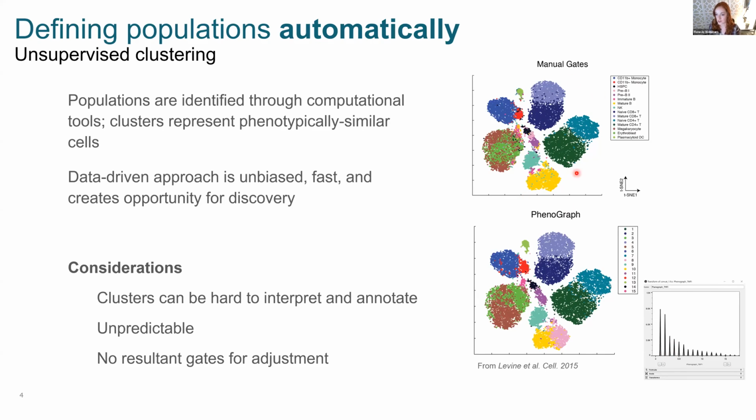But what the authors propose in this paper is that if we annotate this same data, we can find phenotypes that can be found manually that match to these clusters, right? So these clusters are found automatically, without supervision, and they can be traced back to meaningful immunological phenotypes that we can find in the data manually. And here's the cluster and the phenotype it would match to if we gated the data manually. So they are finding meaningful populations most of the time.